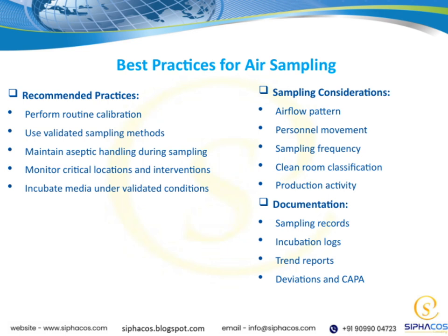Production activity can also influence sampling. Certain operations might generate more airborne particles, so timing our samples around these activities is essential.